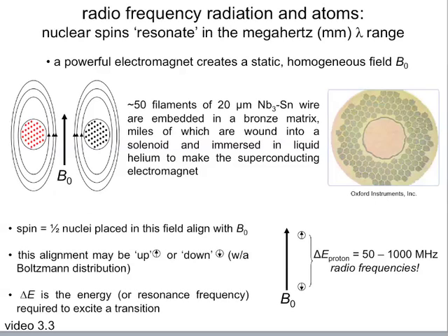Okay, let's pick up here with video 3.3, NMR spectroscopy. Again, thinking about electromagnetic radiation and how we interrogate atoms in biological molecules. And I'm sure we've all had some experience with NMR before, but again, what I'm trying to do here is to pull back the curtain a little bit on how we use these techniques to solve the structures of biological molecules, often much more complicated than the small molecules that we study in organic chemistry by NMR.